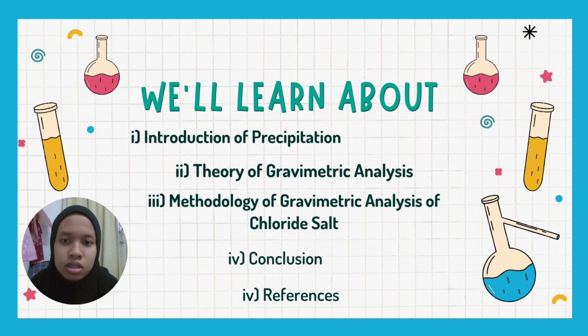So, in this topic, we will learn about first, introduction of precipitation, second, theory of gravimetric analysis, third, methodology of gravimetric analysis of chloride salt, fourth, conclusion, and lastly is reference.